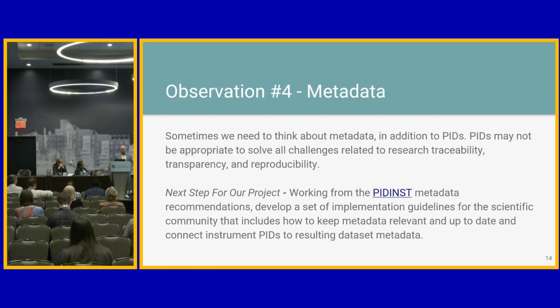And next is metadata, and as a librarian, I found this one fun. We need to think about that. It's one of the biggest things we found in our focus groups: there are so many things that need to be captured for a specific instrument, and a specific instrument can change as you add parts, remove parts, or make changes to it. So that was a big thing we are looking at, the work that other people are doing in trying to create a schema.